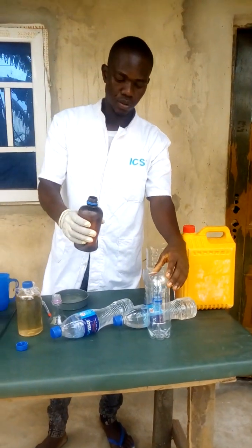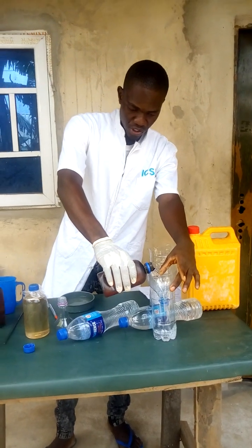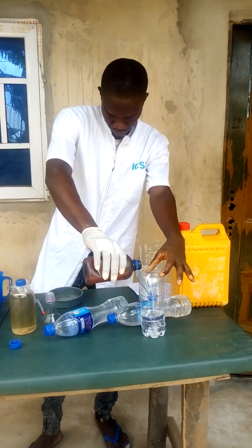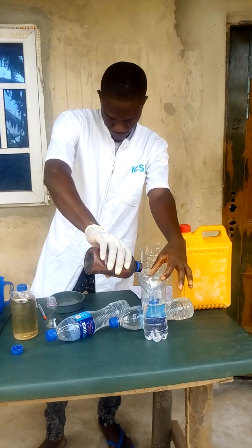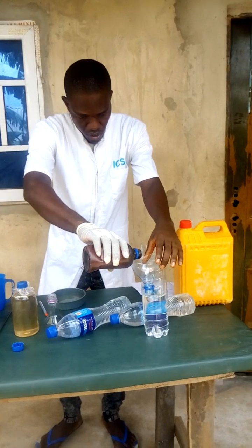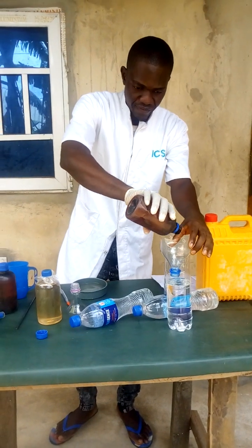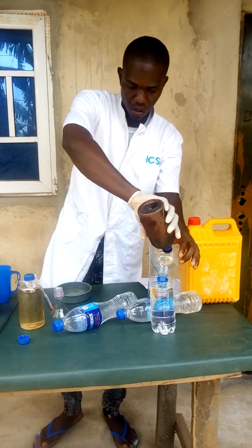So I'm trying to measure out 500 ml. Here we go. That's 500 ml of the alcohol.